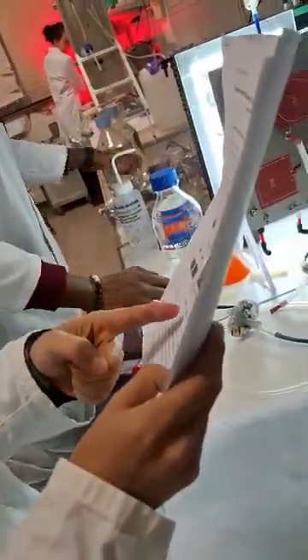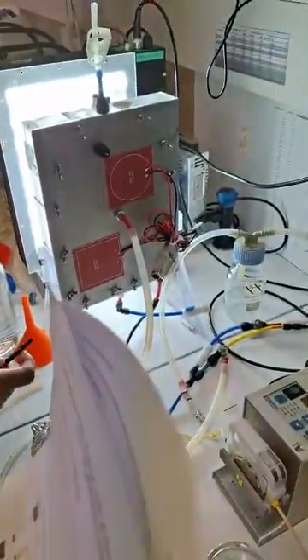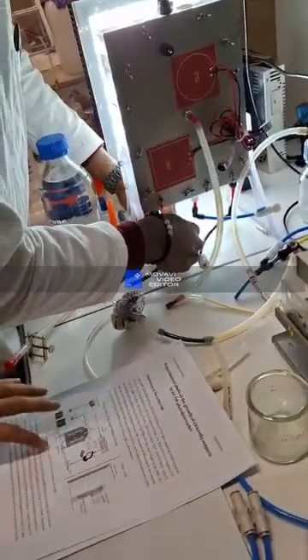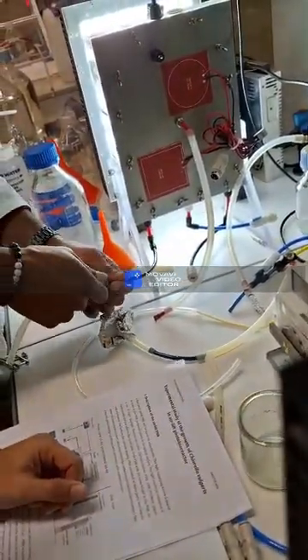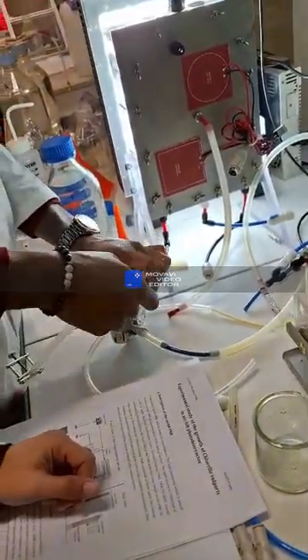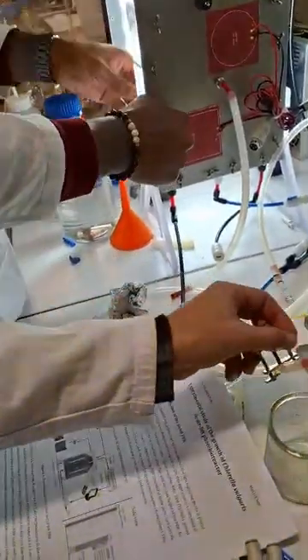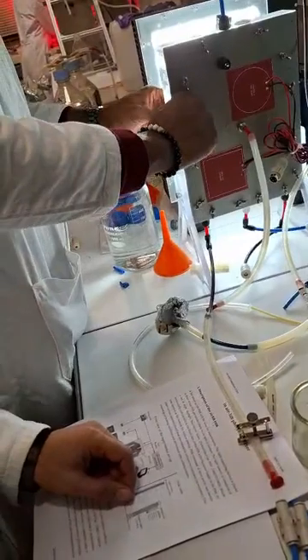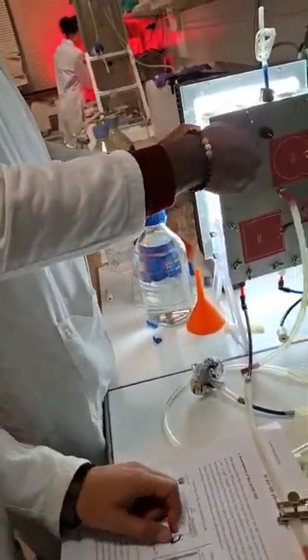Okay. Just filter out, and this is for carbon dioxide. Normally. Okay. So now it will be ready. I just make a verification. It's not tight enough here because you will have a leak.